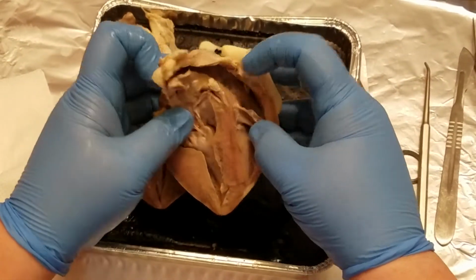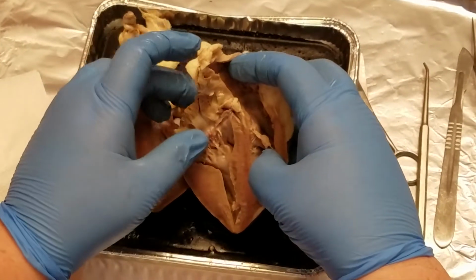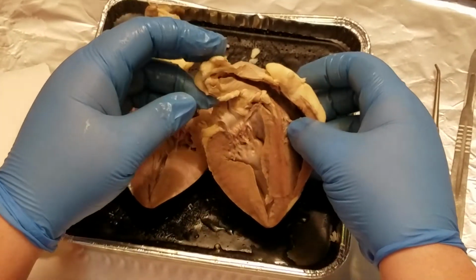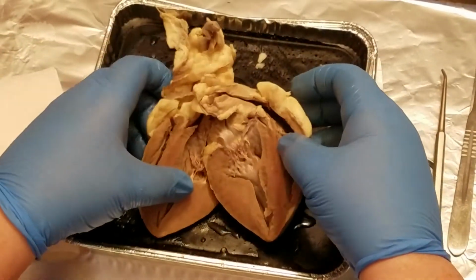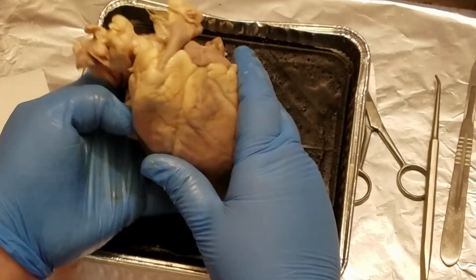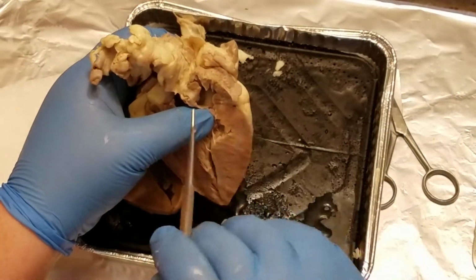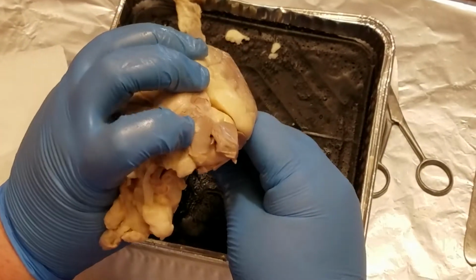trunk, which is here. I cut this open so that we could see, one, the path, and two, the thickness of the walls of the pulmonary trunk. From there, it would go to the lungs to circulate, dropping off carbon dioxide, picking up oxygen, and then it would come back to the heart via the pulmonary veins, which I actually found. They're kind of cut, or they're kind of flat, so I'm not sure.